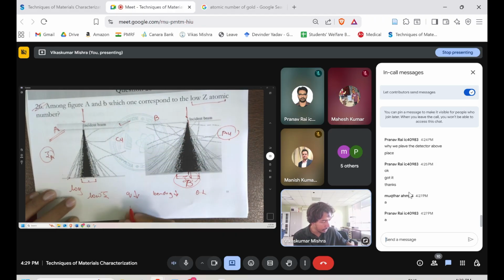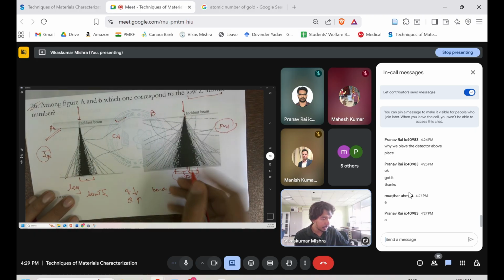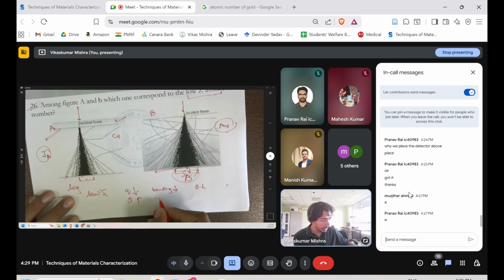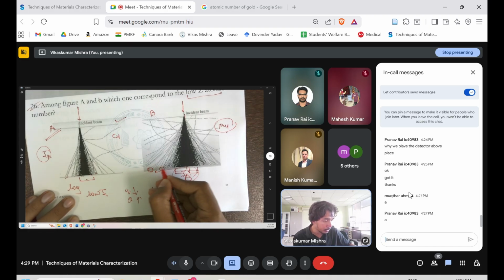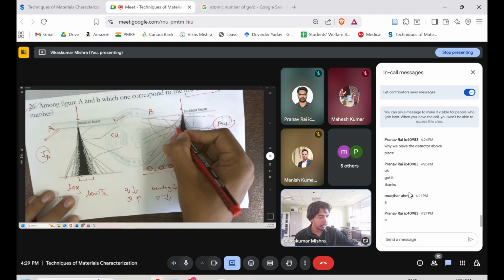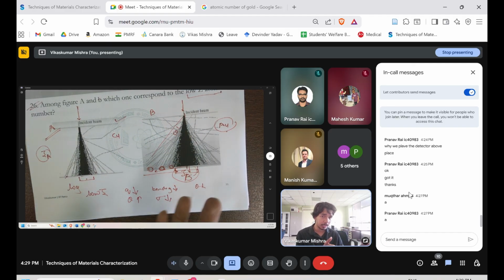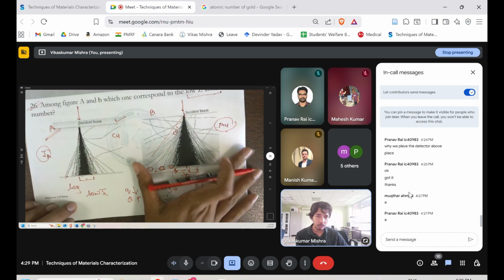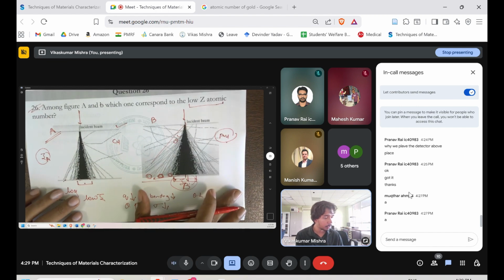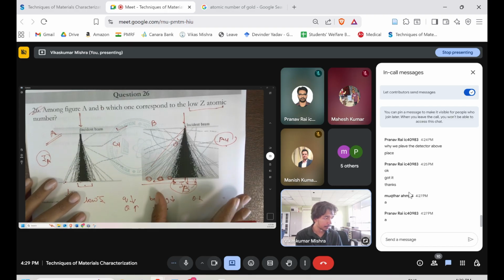The theta is increasing. If I keep on increasing the theta, our scattering is decreasing. Here there is less scattering. Here there is more scattering. If we are getting near to the center, this is theta. If theta is decreasing, we are able to see more and more scattering. Let me tell you, I have copied these pictures from Barry Carter.